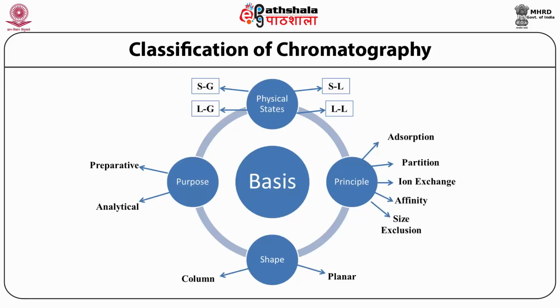Another form is ion exchange chromatography. In this type, the stationary phase is an ion exchange resin on which the ionic sample components bind electrostatically. The resin is either cationic or anionic. The mobile phase is a buffer of predetermined pH. The buffer serves to weaken the electrostatic interactions between the analyte and the resin and elutes it out at a particular pH.